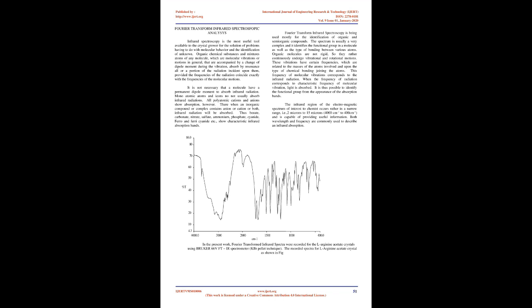Only one major weight loss is observed, just above 200°C and 300°C. It is due to decomposition of L-Arginine acetate. The formation of minute quantities of decomposition residues is also noted in the thermogram. So from the study we conclude that the compound is thermally stable up to 200°C.